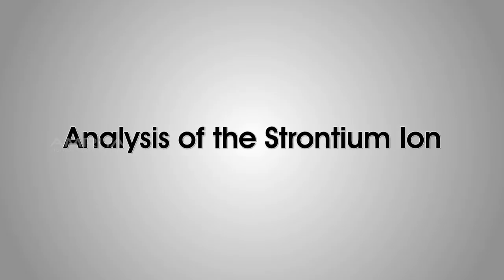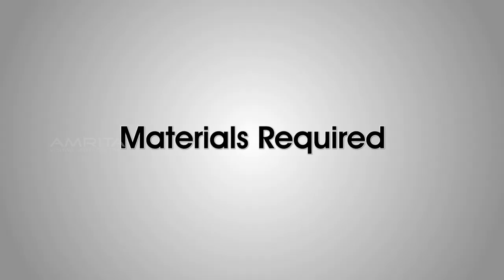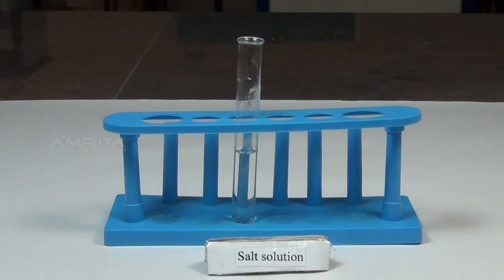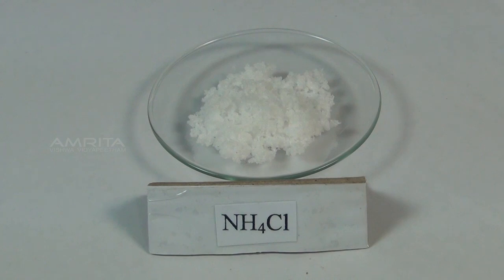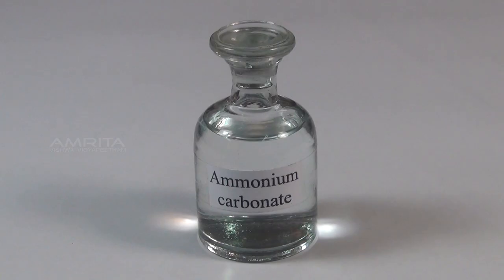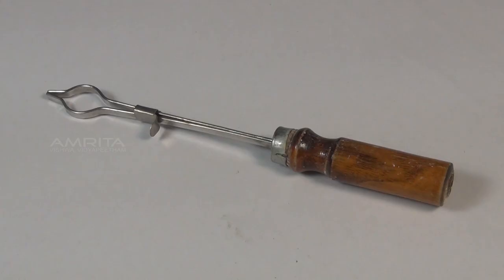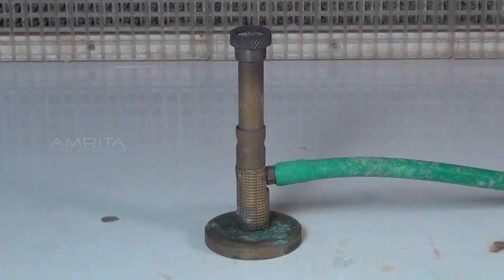We look at the analysis of the strontium ion. Materials required: salt solution in a test tube, ammonium chloride, ammonium hydroxide, ammonium carbonate solution, droppers, spatula, test tube holder and Bunsen burner.